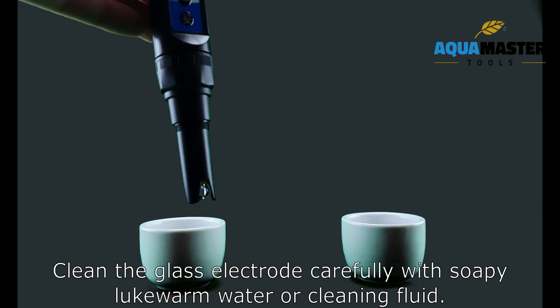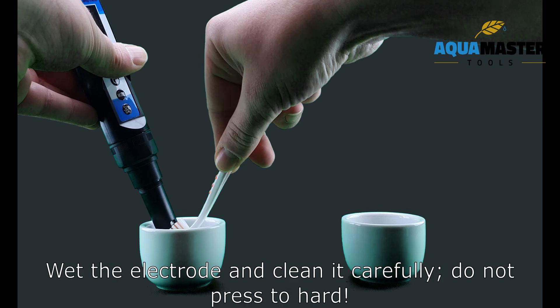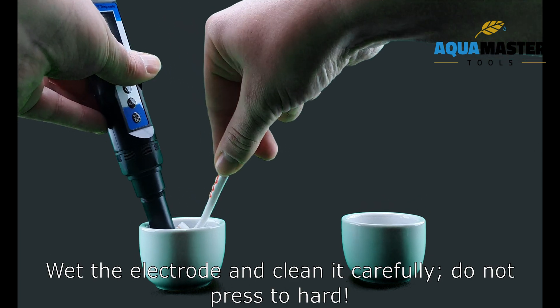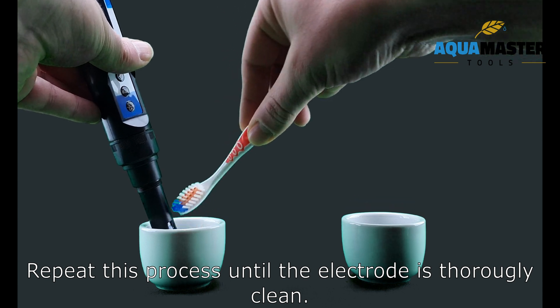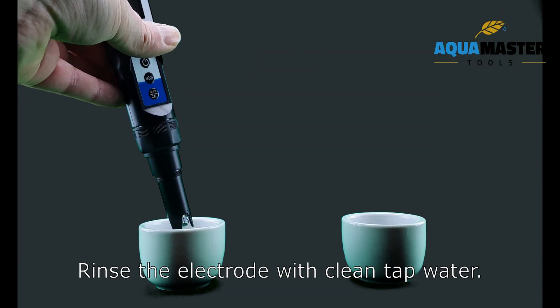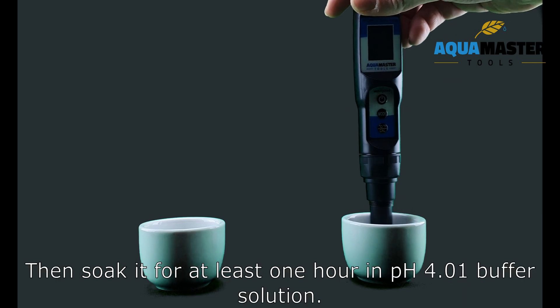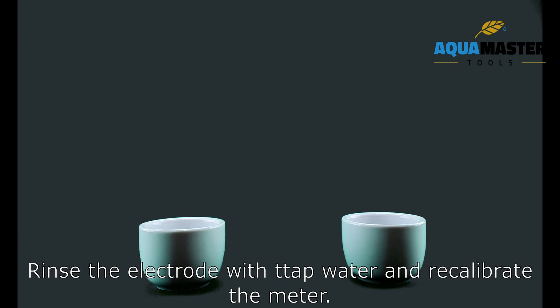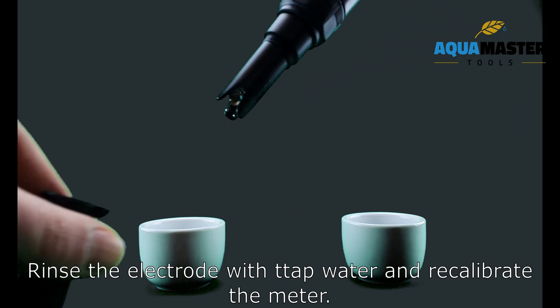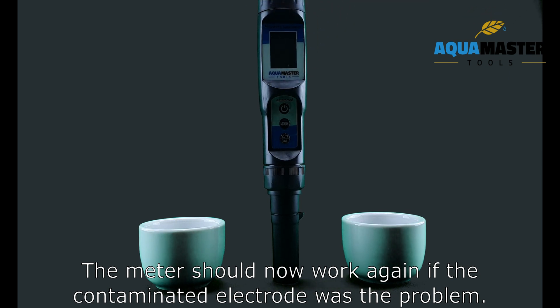Clean the glass electrode carefully with soapy water or cleaning fluid. Use a soft brush, wet the electrode, and clean it carefully — do not press too hard. Repeat this process until the electrode is thoroughly clean. Rinse with clean tap water, then soak it for at least one hour in pH 4.01 buffer solution. Rinse again with tap water and recalibrate the meter. The meter should now work again if the contaminated electrode was the problem.